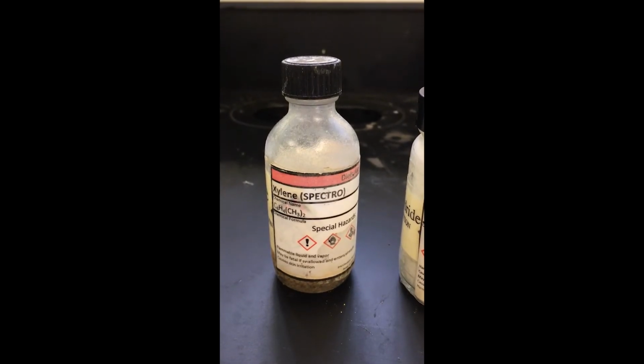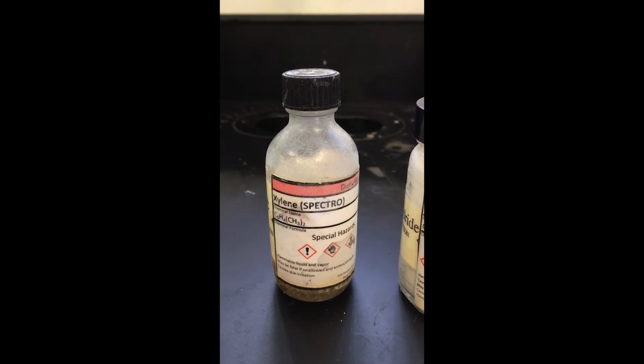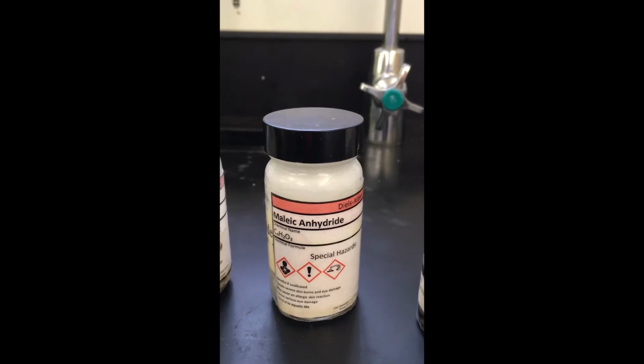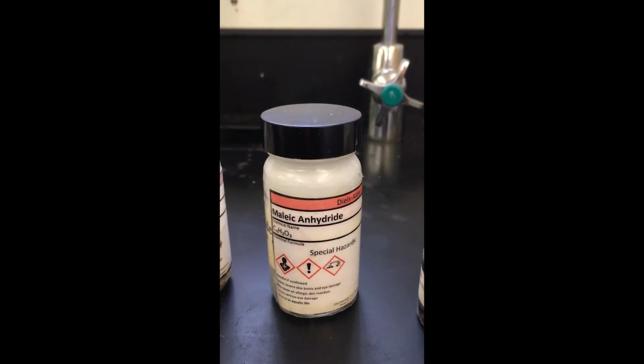All right, so this is the Diels-Alder reaction. Here are the reagents I'm going to be using today. I have xylene, which is going to be our solvent for the reaction. I have maleic anhydride, which is going to act as our dienophile in this reaction.